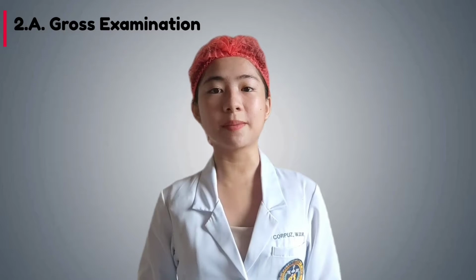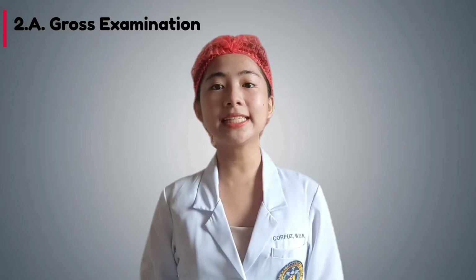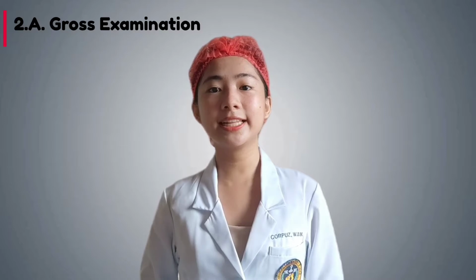Hi and good afternoon. I will be performing gross examination of an organ taken from a full-grown chicken. First, let me define what is gross examination. So gross examination is the first step in histopathology techniques. It is an important stage in histopathology and clinical management since all the initial findings happen during this time. And information obtained in this process will aid the pathologist in rendering a diagnosis during the microscopic evaluation of the tissue. So, what do we do in gross examination?